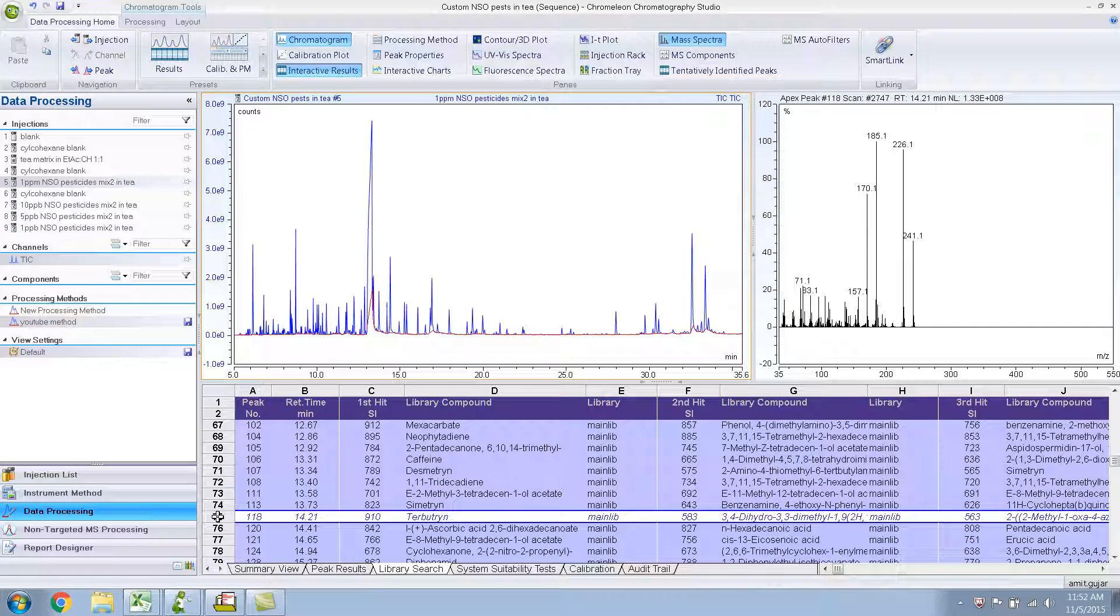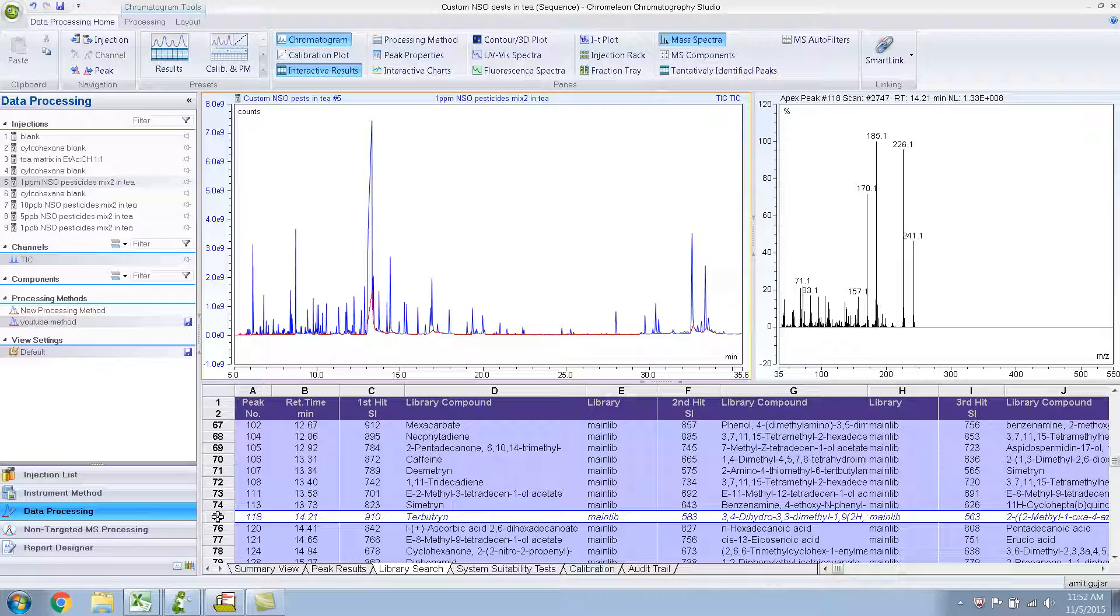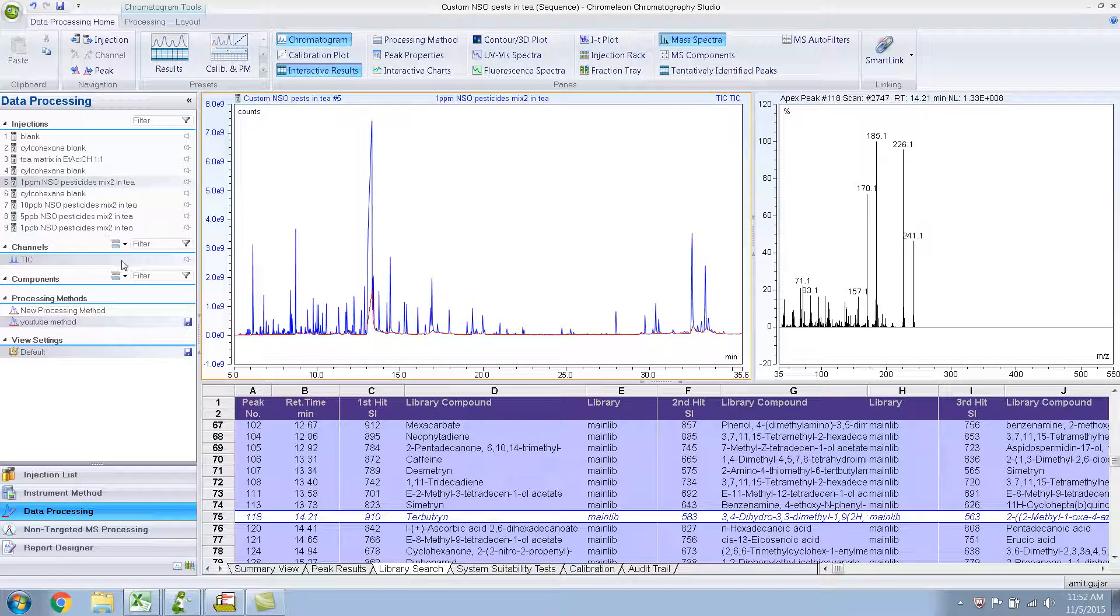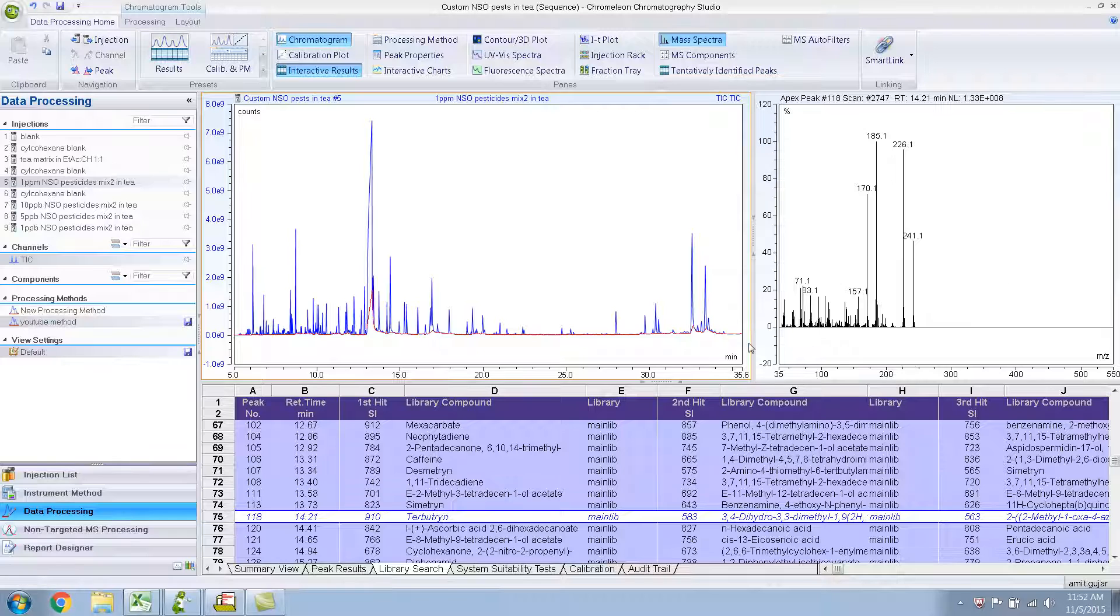Okay, so this is part 2 of the video which is named Data Processing in Chromelion. If you haven't watched part 1, please do so because this is a continuation of that and you might not follow what's going on over here.